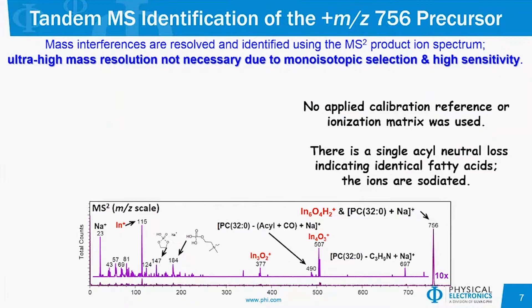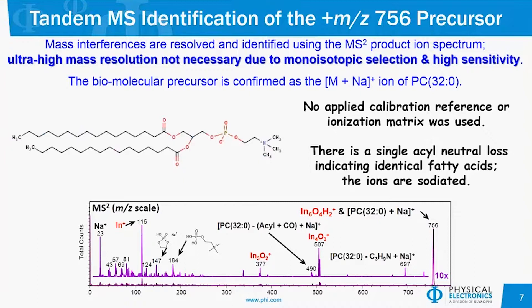Coming back to our biological example: when we do the tandem MS analysis of our precursor at 756.55, what we can see in the product ion spectrum is that there are two unresolved components within that monoisotopic precursor selection window. One component we can readily identify is the sodium adduct of phosphocholine 32-0 — 32 carbons in the acyl chains with zero unsaturations. The other thing we see is an unresolved interference from indium oxide arising from the ITO substrate the tissue section was mounted on. Without any calibration or ionization matrix applied, we identify two components that are unresolved in that selection window.